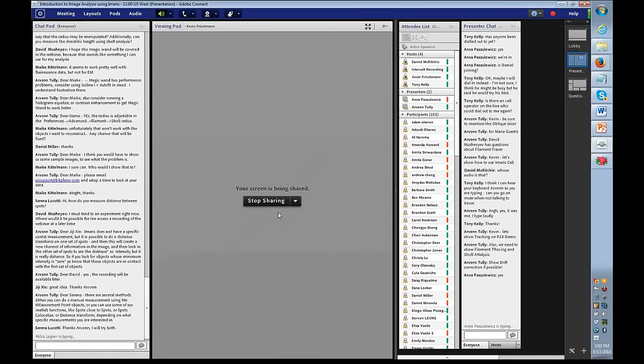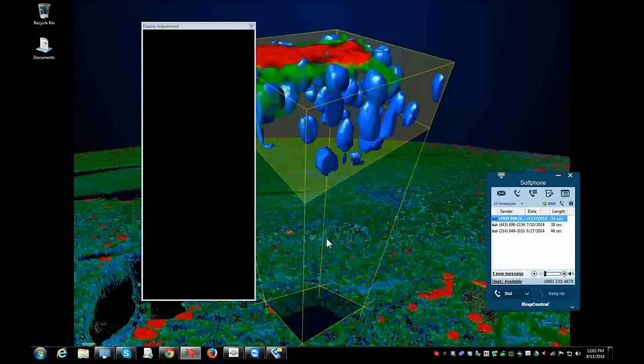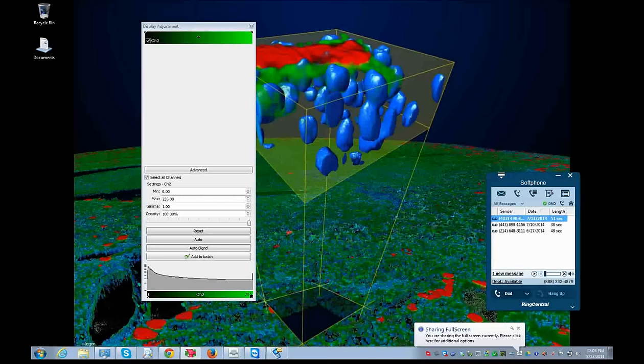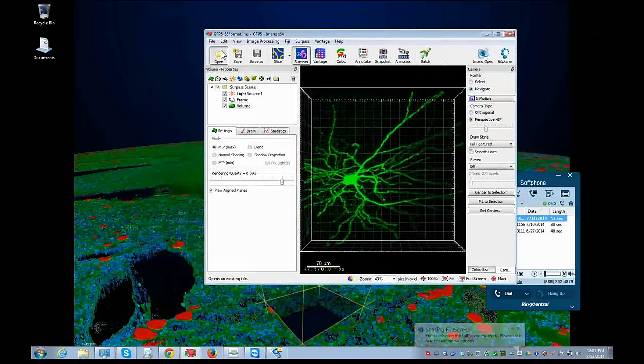So let's see, do you want to make me presenter? Let's see, or no, I have to make myself. Yeah, I'll just stop sharing my screen. I guess I could have given you remote control, but if you'd rather share your screen. Okay. Yeah, I'll do it on my screen. Okay, so someone else is going to have to take over typing duty. I think I caught up to everybody. Okay, I'll keep an eye on the chat. Let's see here. I'm going to pick a little bit easier image. Just give me one moment.